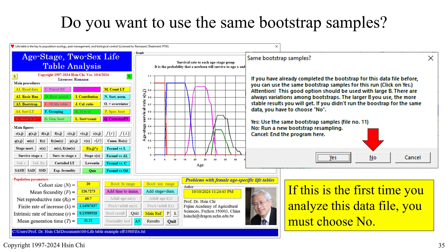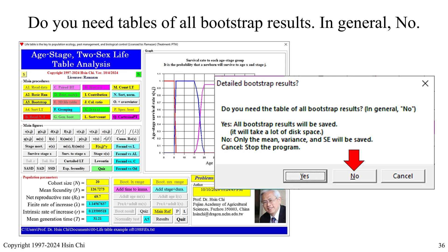If you have already completed the bootstrap for this data file before, you can use the same bootstrap samples — click Yes and select file number 11 from your previous analysis. When asked if you need the table of all bootstrap results, in general choose No; only the mean, variance, and standard error will be saved. If you choose Yes, all bootstrap results will be saved in a long table and will take a lot of disk space.